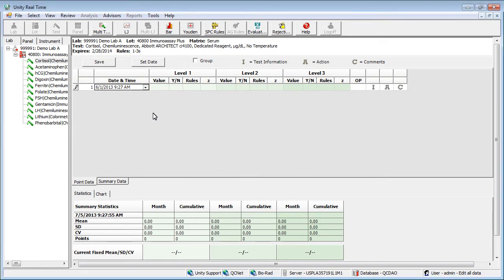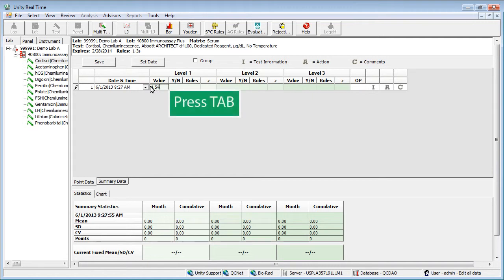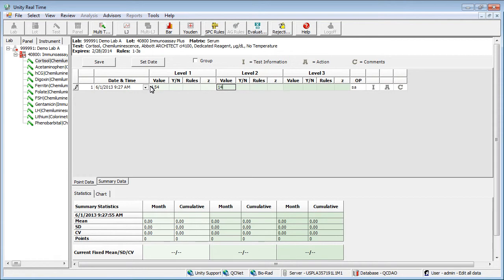Enter your first value. Press Tab to move to the next field. Continue to enter the remaining data, pressing Tab to move to the next field.